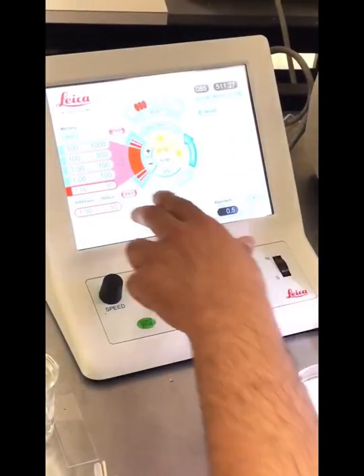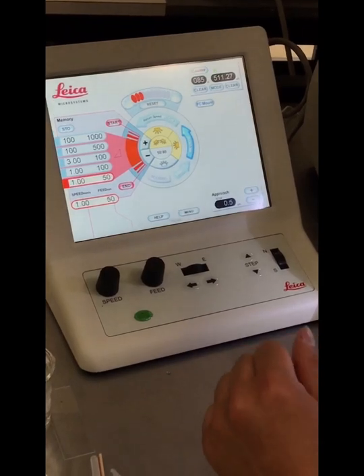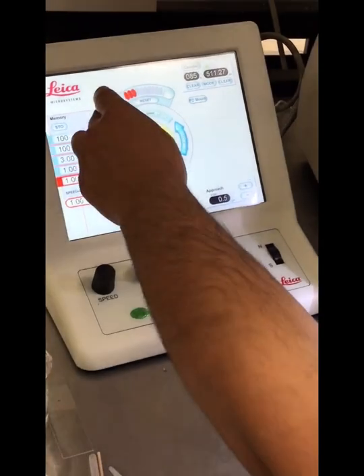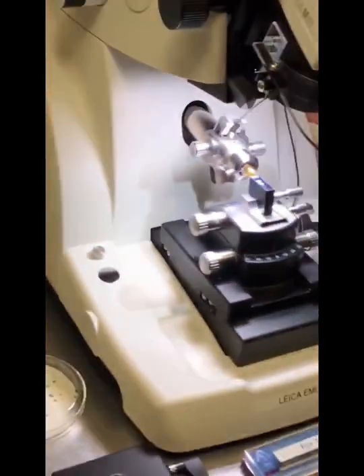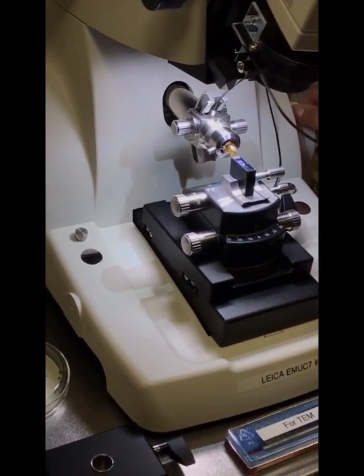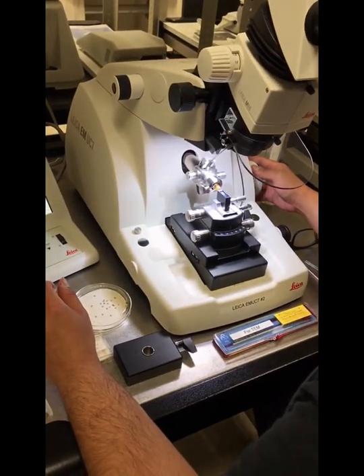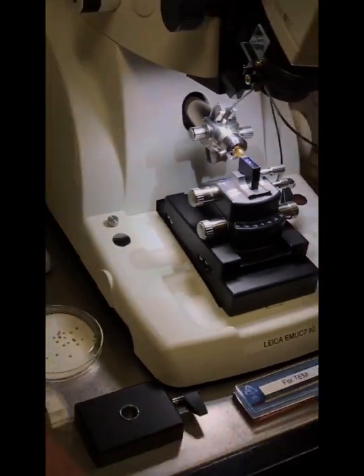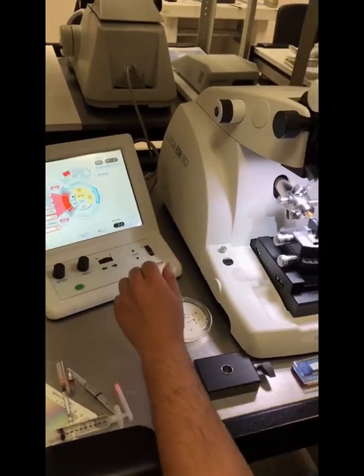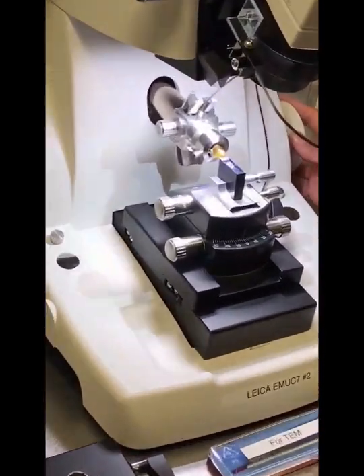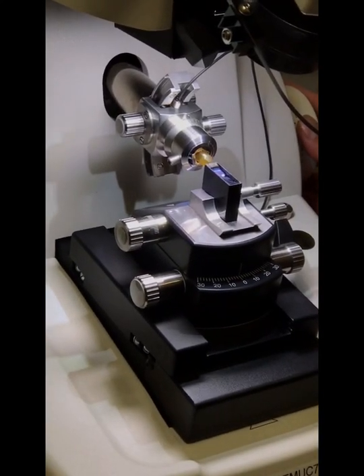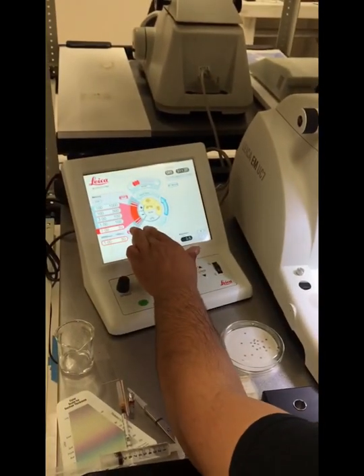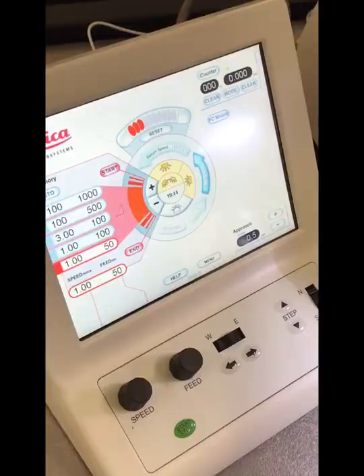Okay, after we adjust our speed here for ultra-thin sections, we can create our window. And we'll start up here by moving the handwheel to the position where it would be very close to cutting. So just a moment before the cut. And then we press start. And then you'll move the handwheel clockwise until your block goes below the knife just after the cut. And that's where we'll end the cutting window.